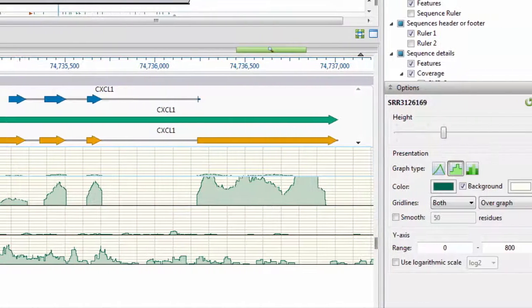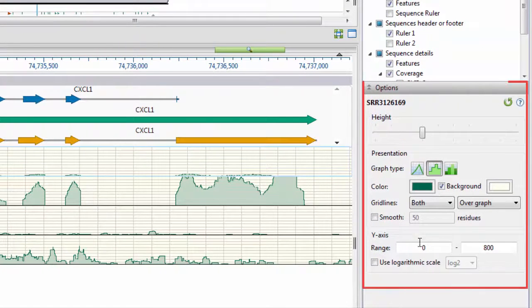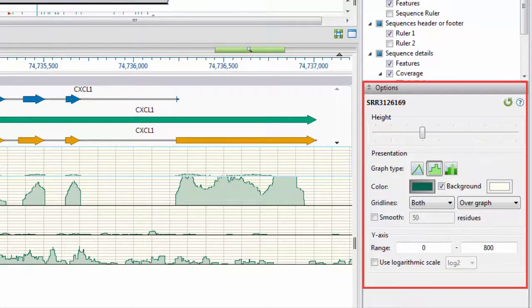From here, I can change the appearance of my image by changing the graph type, color, height, and other aspects of the image to prepare it for publication.